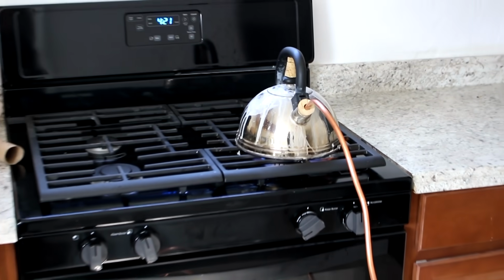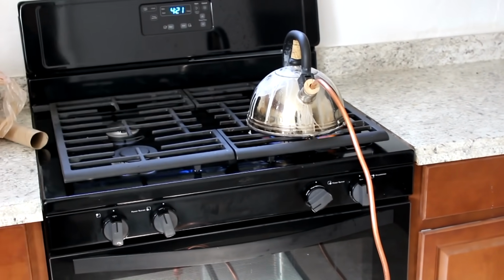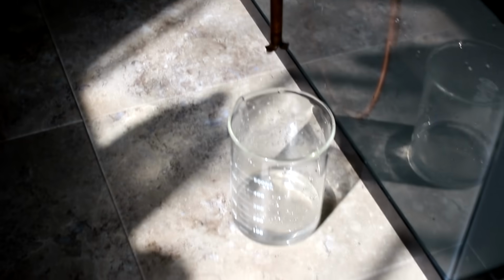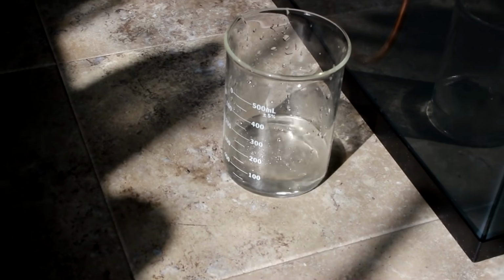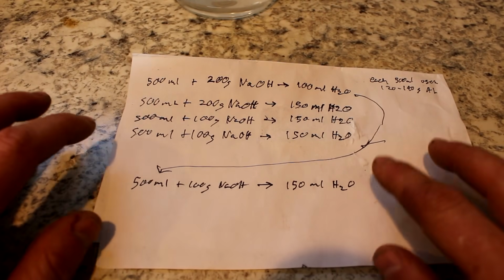As you can see, I'm distilling off some water, and this is the stuff that has been treated with the lye and aluminum twice now. So yeah, this was 2 liters of water, and now it's looking like I'm going to get less than 200 out of it. So here's a brief synopsis of everything that I've done so far.